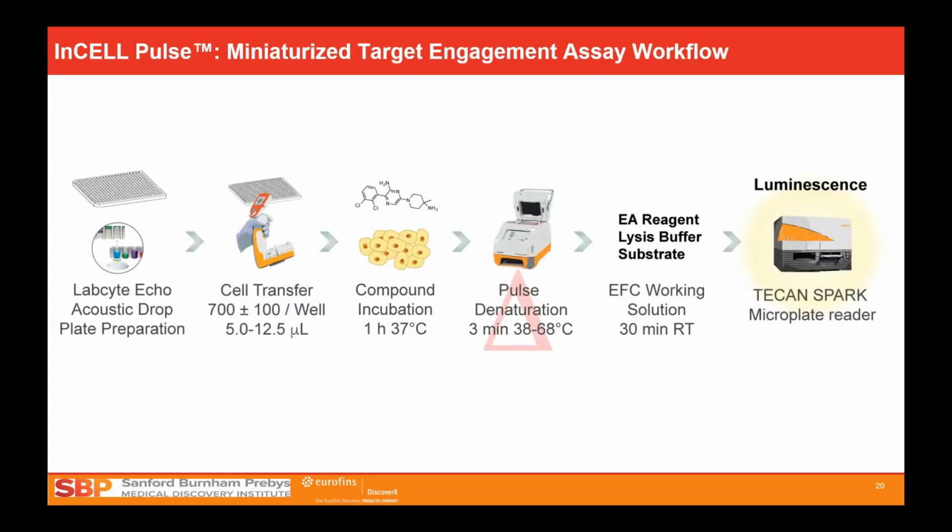So these thermal profiles are nice to look at, and you generate something analogous to a protein thermal shift. Shown here is our workflow. What we were able to take advantage of in my lab was a miniaturized form of the assay that was developed at the Prebys Center at Sanford Burnham Prebys Medical Discovery Institute. They had actually miniaturized this for us. Also through the Prebys Center, we have access to a liquid handler, the so-called Echo machine. Basically, we're able to put nanoliter volumes of compound onto 384-well plates.